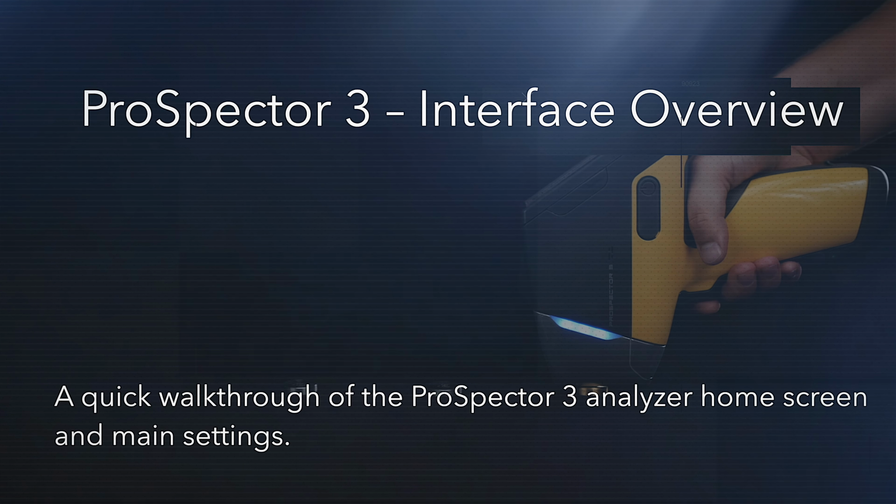So the next menu item we have is the settings, and here you see a big list of different settings. The first is screen brightness. It's very easy. You can adjust the brightness of the screen. The next one we have is the sound volume. Sound volume works with the voice. If you turn on the voice, the analyzer will indicate with a sound that the measurement has ended.